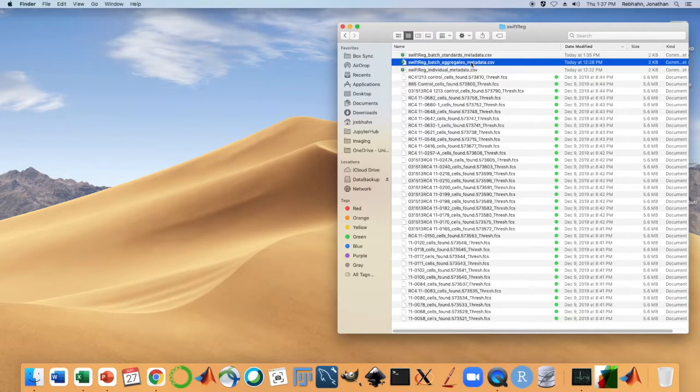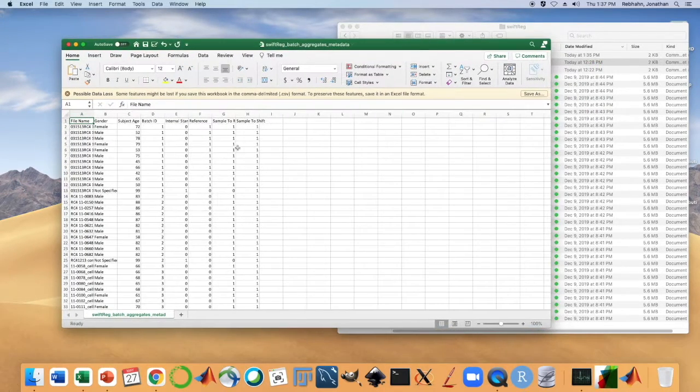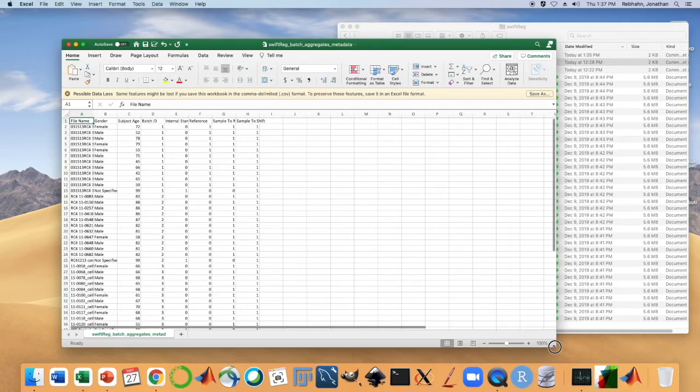And in a similar way, if, again, we didn't have internal standards following these batches, we could still do batch registration, and we would specify all of the samples as a set, and this would create a consensus for the entire batch, which would then be used as our reference. And we would have to specify the individual samples in sets as well, and each batch would then make a consensus for that batch that would be registered to the reference.